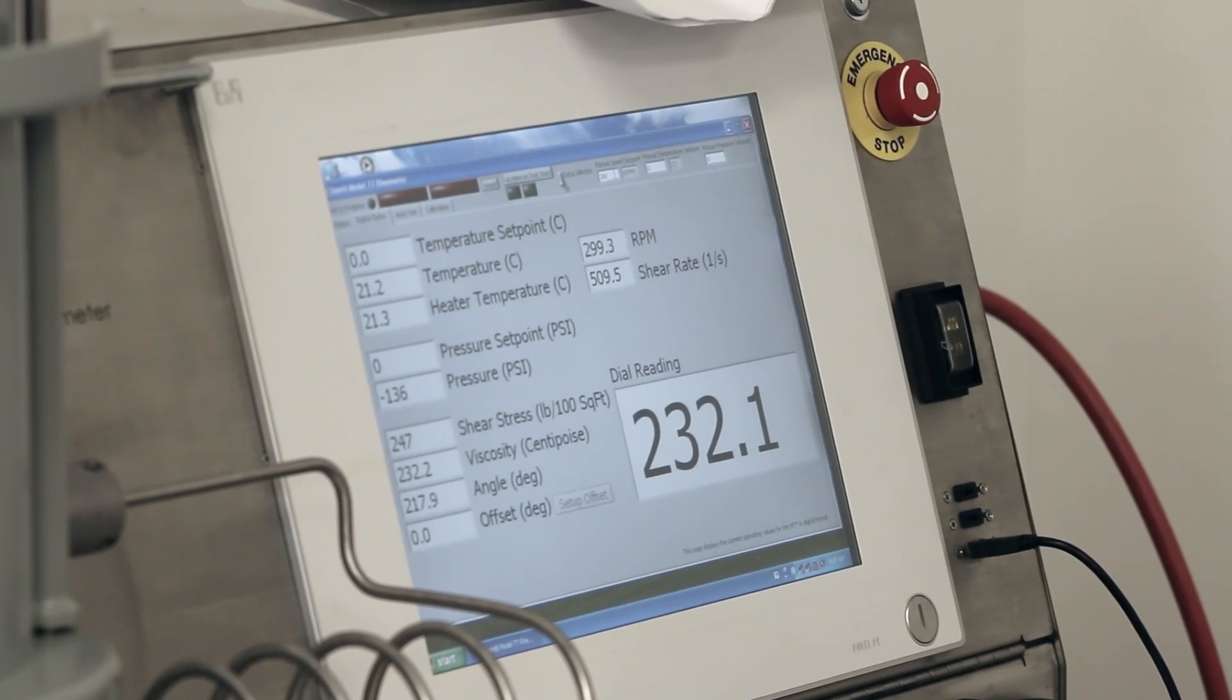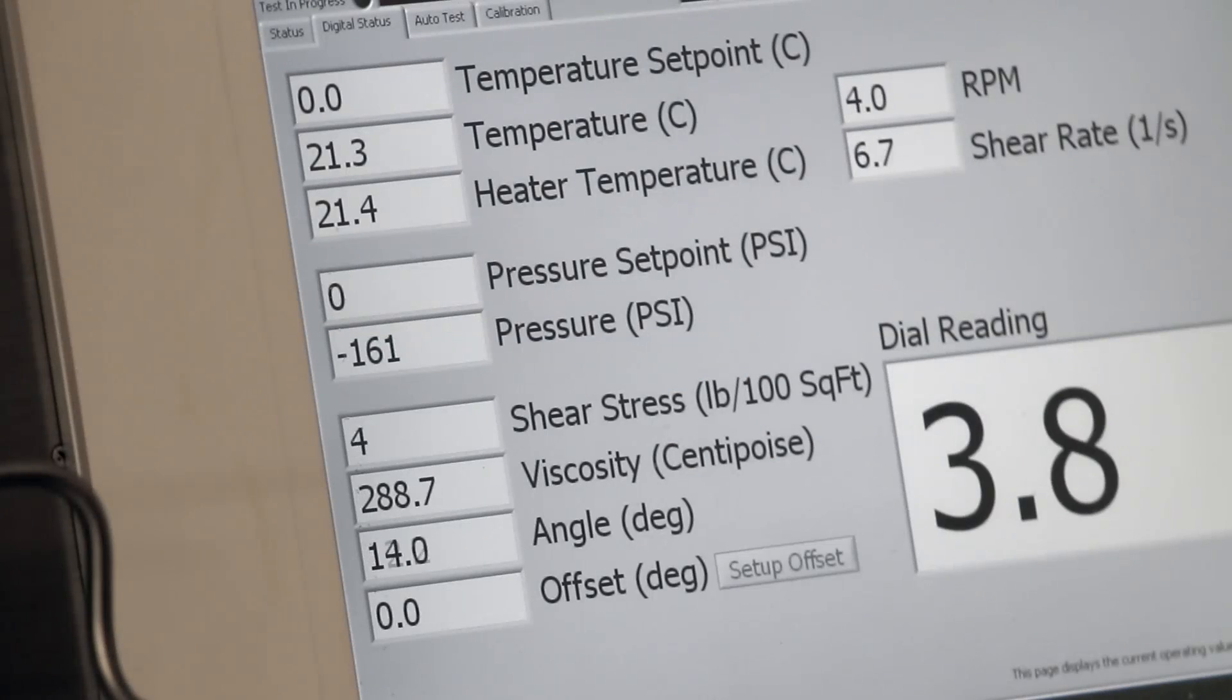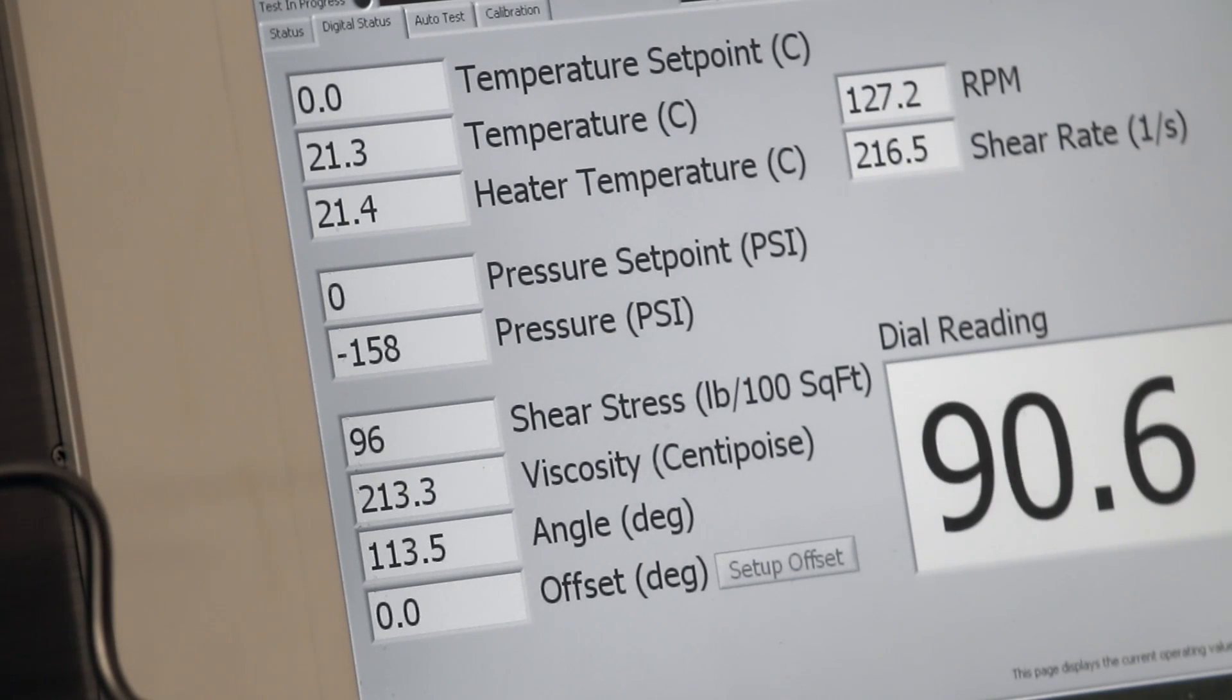the user can zoom in on a particular temperature-pressure combination, view raw data, call up graphical displays, and generally monitor all aspects of the test.